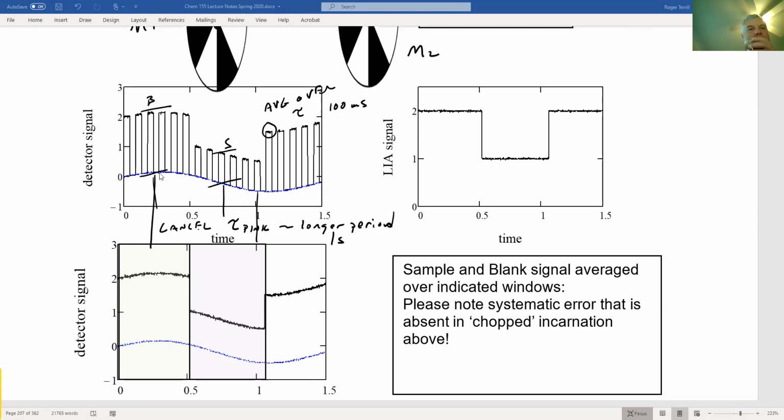Who wants to explain to Catherine why doing it this way will cancel this flicker noise or this pink noise, and it will preserve the amplitude of the signal, which is going vertically? Who's someone who answered yes, hopefully? Zero volunteers.